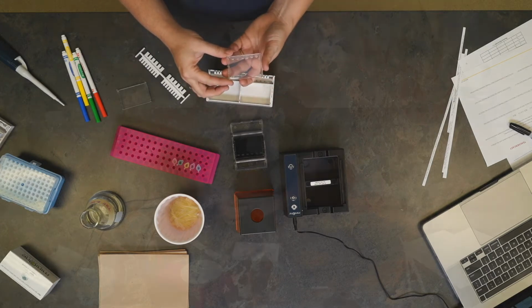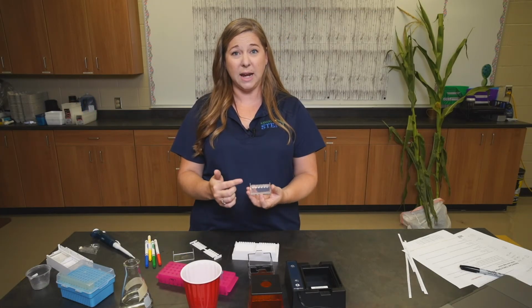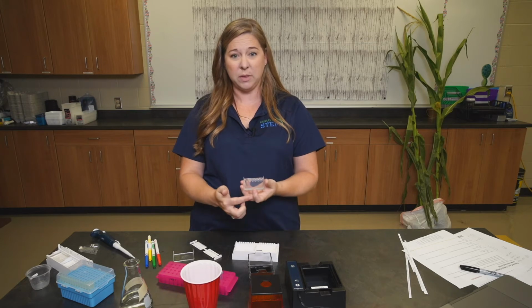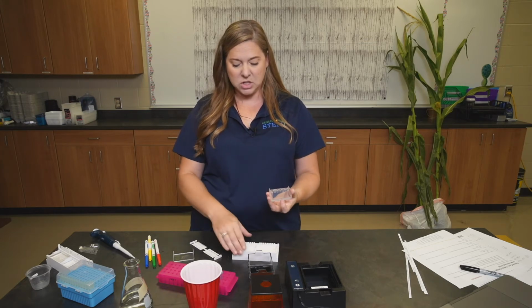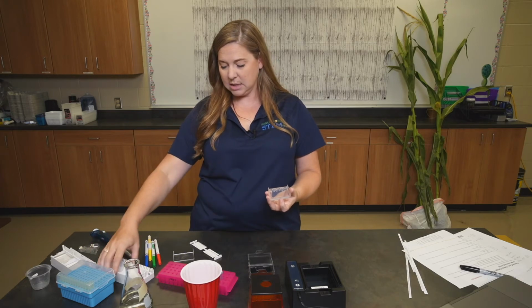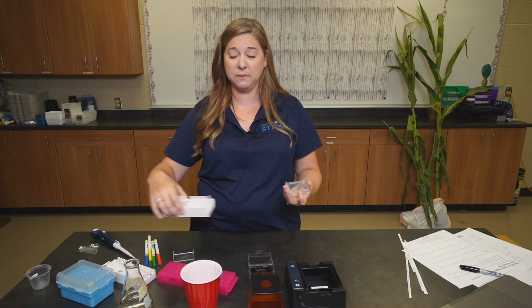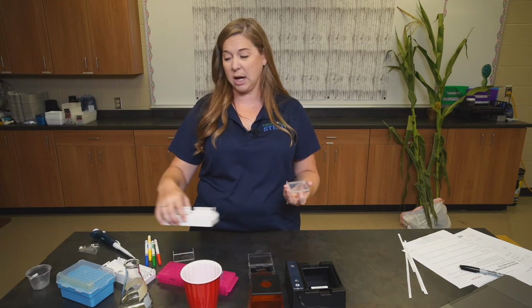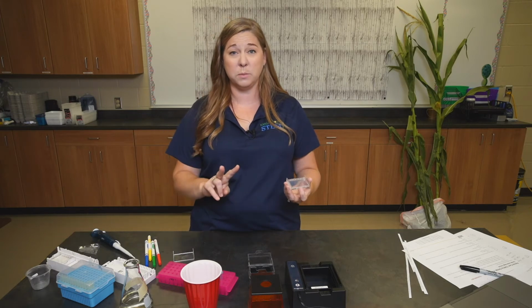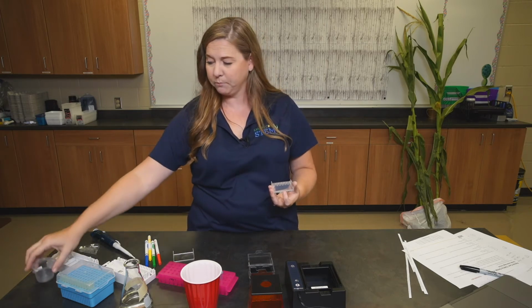One thing I always point out to my students is there is no plastic on the top and bottom. So it's very important that as they hold these, they're holding them with a little brace below, just like this. So now what we're going to do, we can set this aside. And by the way, did you notice that each one of these trays allows you to cast 2 gels at once? So you could share a tray between 2 groups of students. You'll need 2 gel cups, but only 1 tray.